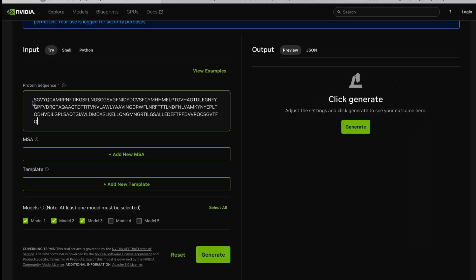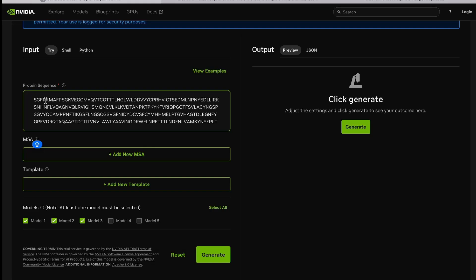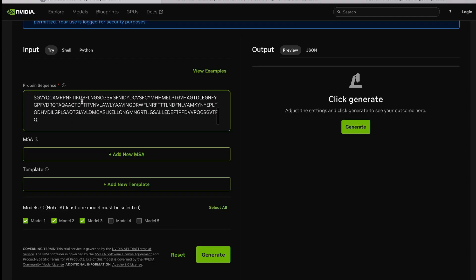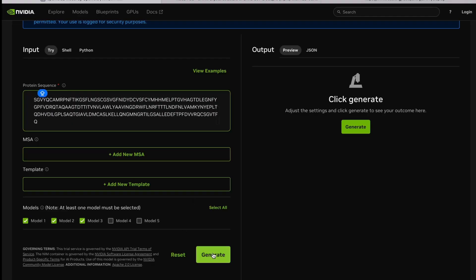This wild-type sequence will be modeled very easily, but instead we will do some mutation. I'm doing an arbitrary mutation here — otherwise you can go to UniProt or ClinVar to see what variants exist and base your mutation on that. If you want to know all these steps in detail you need to join our session, because covering all that would stretch this video very long. I have done the mutation — in place of R I have replaced it with F at the fourth position. Now we'll see whether we are able to generate a mutant model.